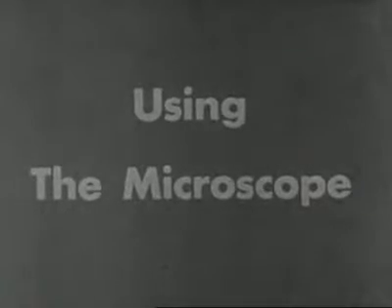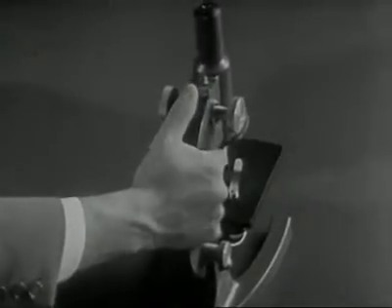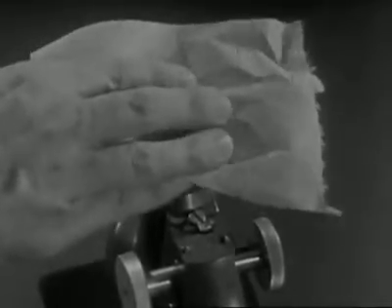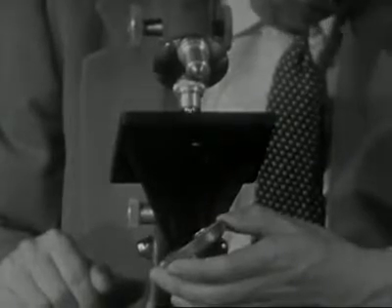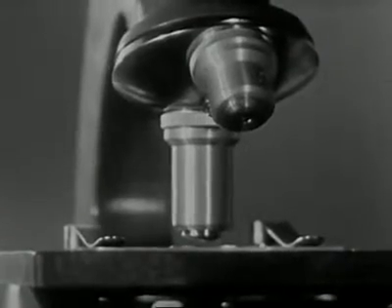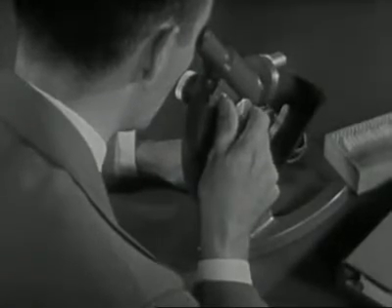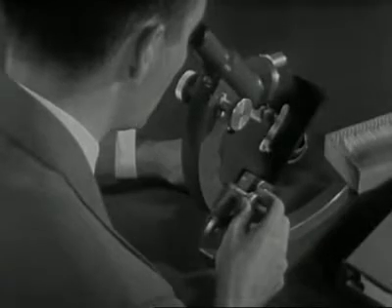And now let's review the most important rules for using the microscope. Handle the instrument carefully. It is delicate and expensive. Keep the lens surfaces clean with lens tissue. Adjust the mirror for even, comfortably bright light. Carefully adjust the objectives to a position near the slide. Then focus, first with the coarse adjustment, and complete the focusing with the fine adjustment.